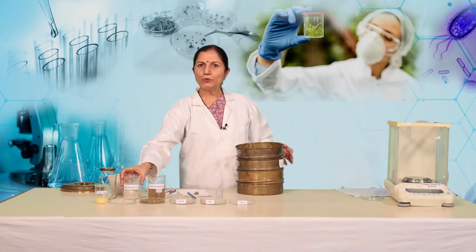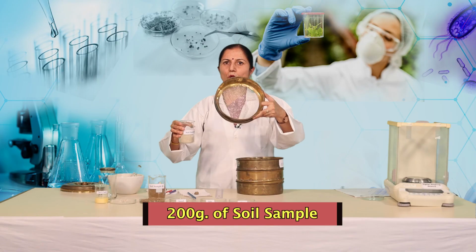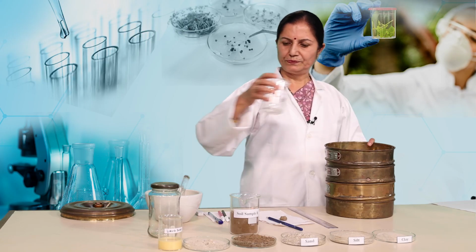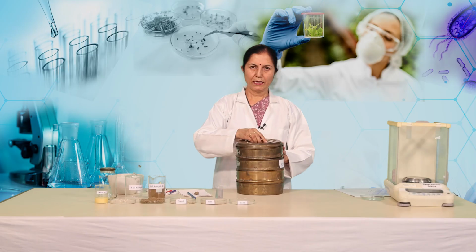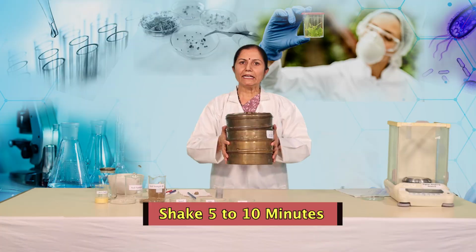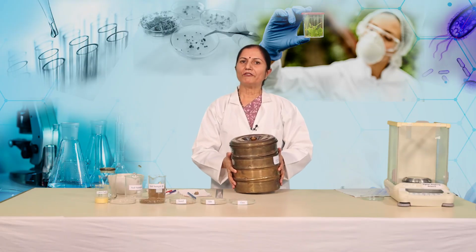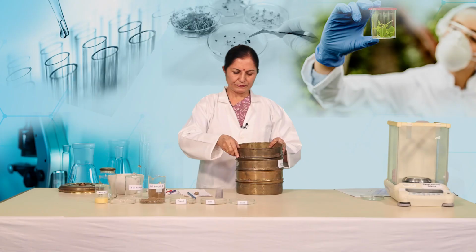Place 200 gram of soil sample in the first chamber with 2 millimeter mesh. Close the lid. To sieve the soil, shake the set mechanically for 5 to 10 minutes and collect the soil fraction in 3 different petri dishes.